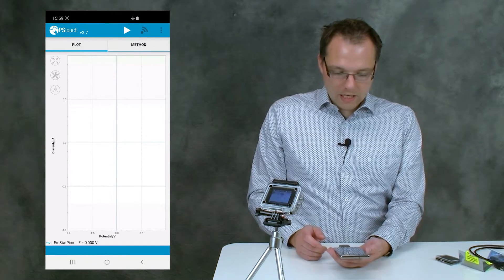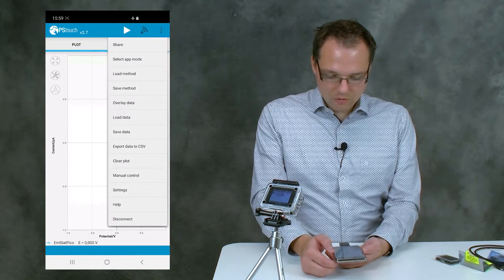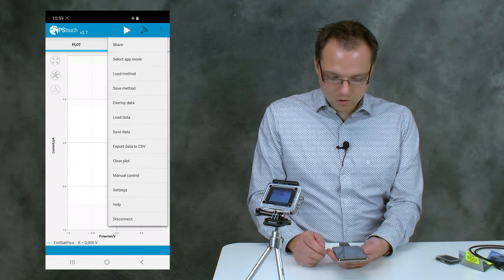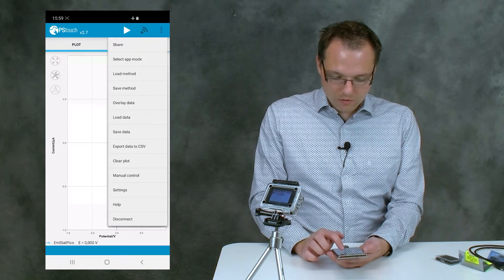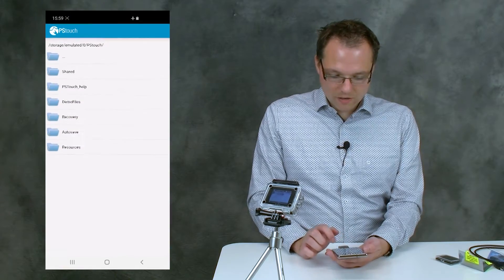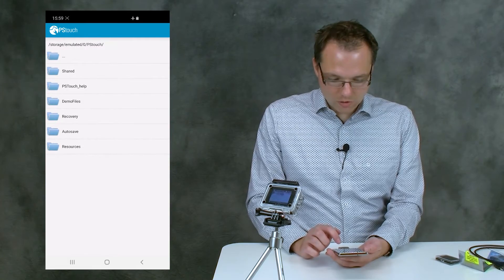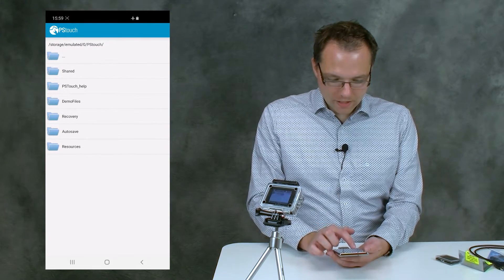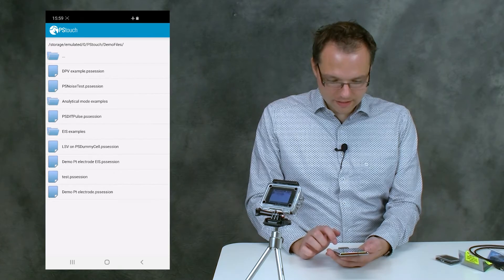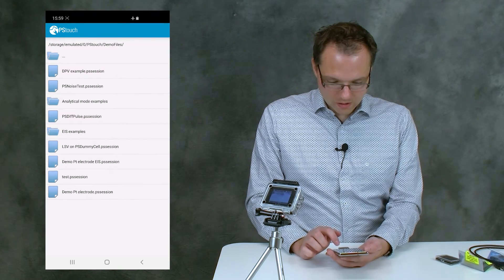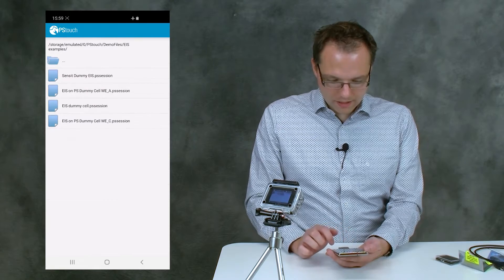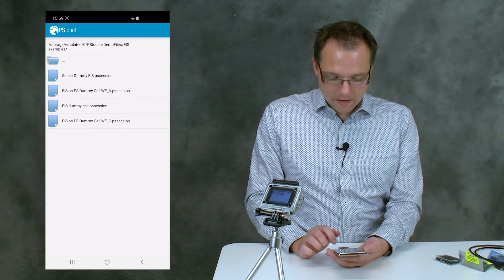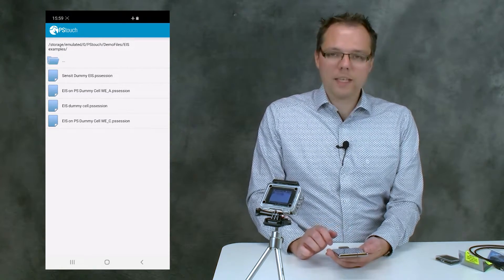Okay, now we want to do our first measurement. To do that, we just load a measurement that was done previously and use the measurement parameters for that. For that, you tap on Load Data, then on Demo Files, and on EIS Examples, and Sensit Dummy EIS.